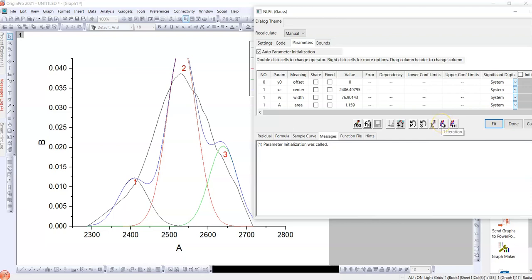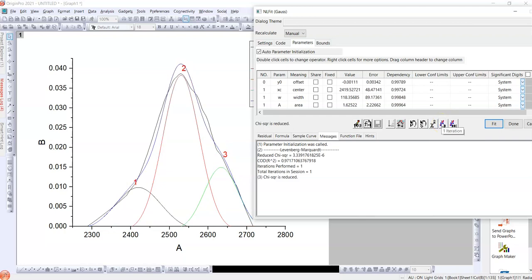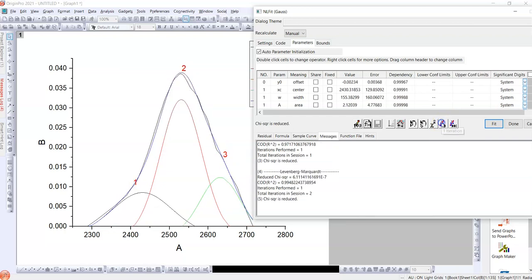I will click on the first iteration. See, this lies down, second iteration. This is the first iteration. Reduced chi-square value actually indicates the goodness of fitting. The terminology is reduced chi-square. You can find it anywhere in Google. First one was 0.97, but second one came up with 0.99.